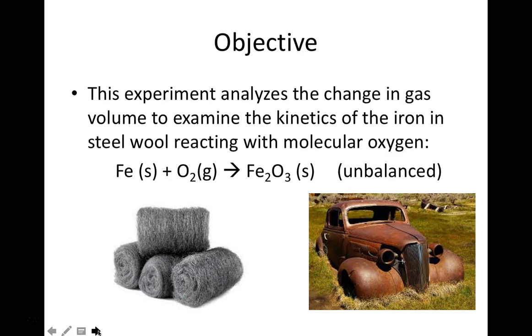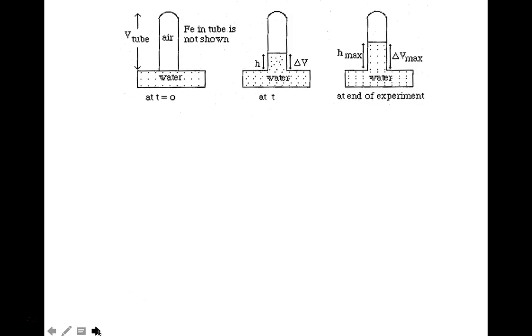It's reacting with the solid iron and becoming solid rust, or iron oxide. So that's reducing the volume of oxygen inside the test tube, which reduces the partial pressure. That pressure needs to equalize with the atmospheric pressure, and what that does is it pulls the water level into the graduated cylinder. So we can measure that as a height.